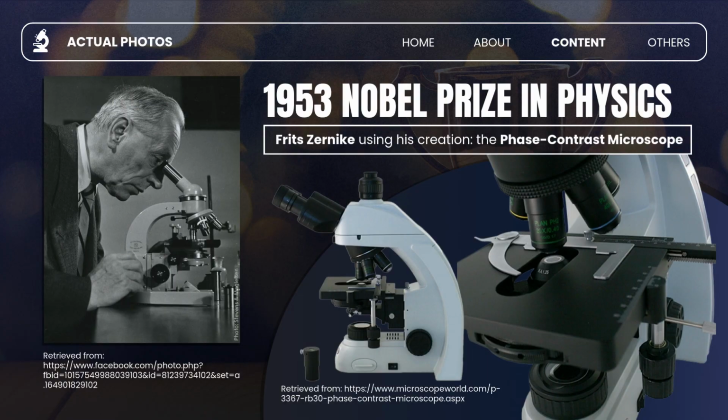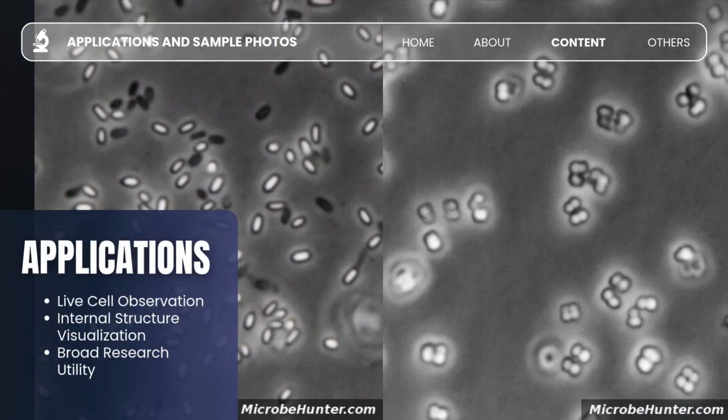Here are real images of the microscope invented by Fritz Zernike, who won the 1953 Nobel Prize. It looks like a regular microscope, but its optics allow clear viewing of live, unstained cells and microorganisms. Now that we've seen how phase contrast microscopes are built and how light travels through the system, let's move on to their applications and what we actually see under these microscopes.